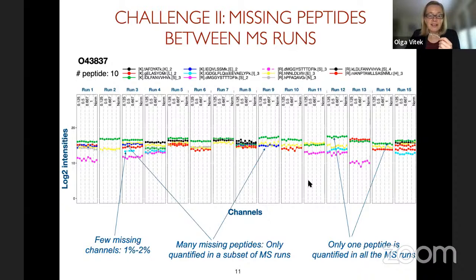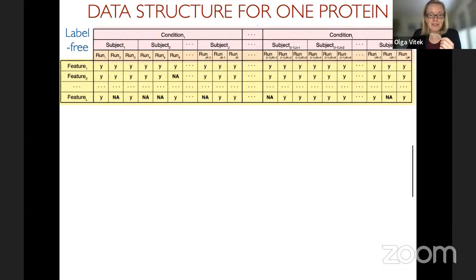And so this is the biggest challenge for us, because now not only do the intensities shift between the mixtures, but also we don't even get to see the same ions, and they have different ionization efficiency and different properties. So how can we integrate the information across multiple mixtures to still distinguish these artifacts, which are due to data acquisition, from the actual true biological signals? This is the objective of MSstatsTMT.